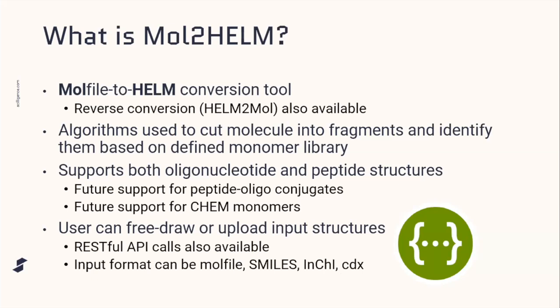And possibly even more importantly, we have RESTful API calls available to Mol2HELM. We are seeing more and more in recent years that people are preferring to interact with these types of tools via API as opposed to just through the UI. And so we've made sure that everything that works through the UI for Mol2HELM is also functional through our RESTful API calls.